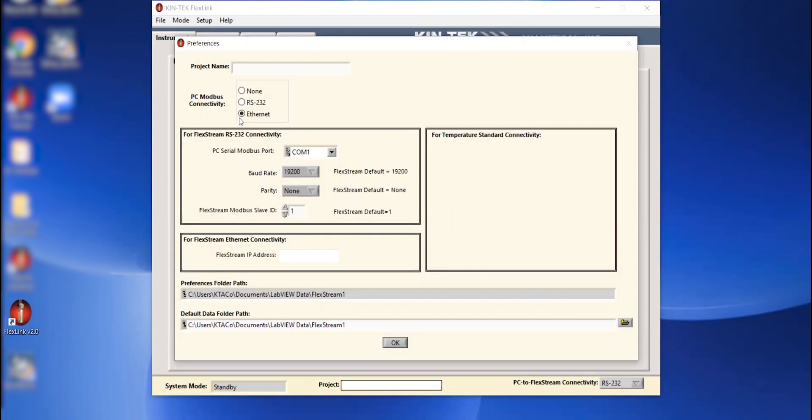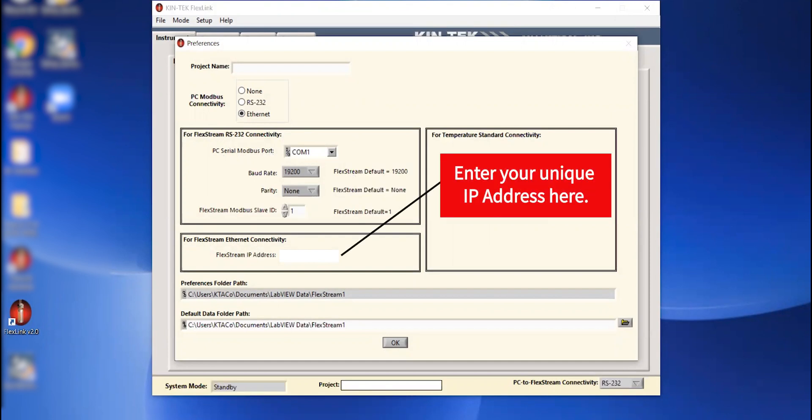Since we're going to use ethernet, I'm going through our network. I'm going to set up my IP address to connect to an existing instrument that's set up in the back of our building. So I'm going to go ahead and put an IP address here. Hopefully I have the right one. And I'm going to hit OK.